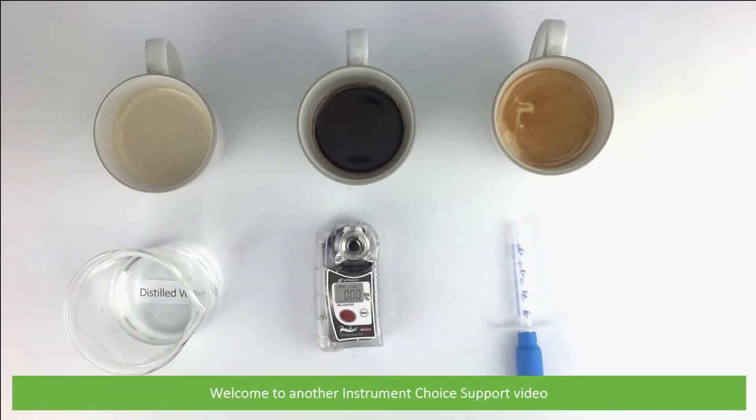Hi and welcome to another Instrument Choice support video. In this video we will show you how to use the IC PAL Coffee to take Brix measurements.